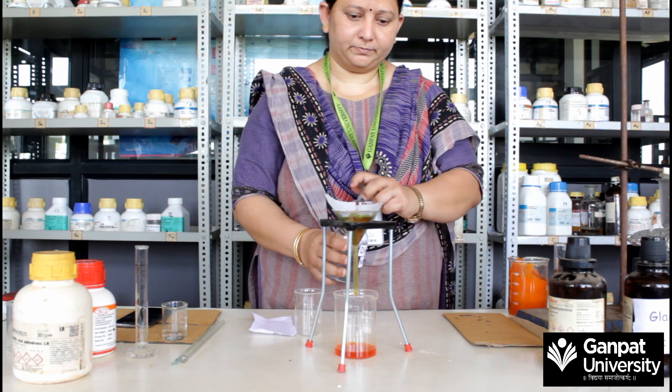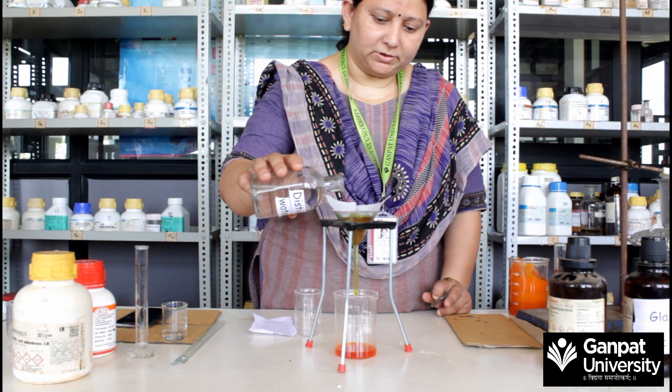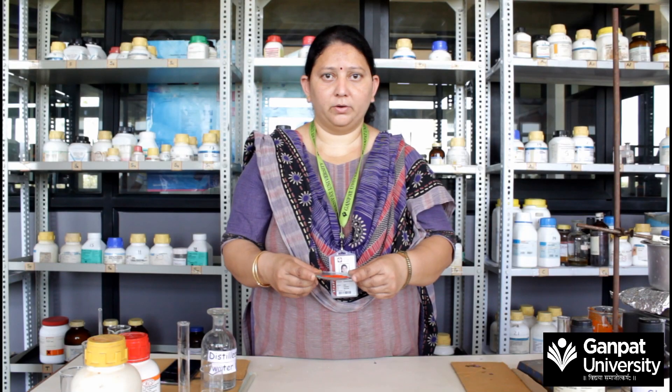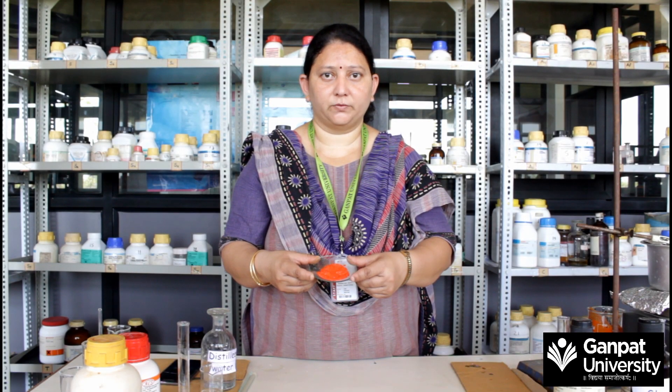Wash with distilled water. Now dry the crude product and recrystallize from hot water.